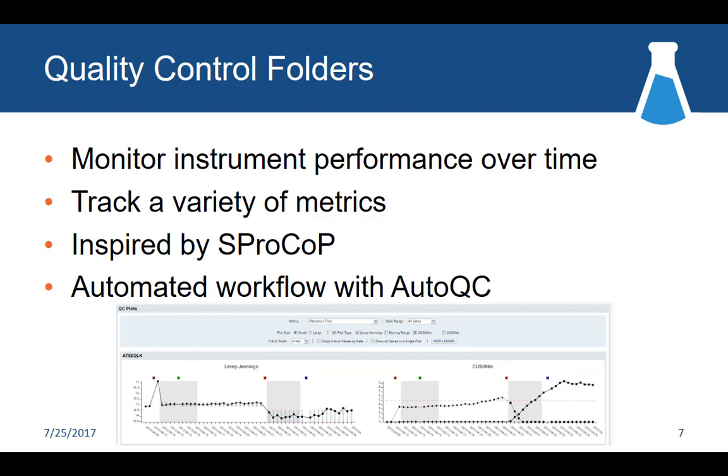So I think this is 50 or so runs of the QC, and you can see very quickly, okay, something went significantly different on that third sample, and then something shifted. We're maybe halfway through our QC samples, and so this gives us a way to dive back and look and figure out, okay, when did things go off the rails? And then also identify, okay, I need to intervene now, because if my QC sample is behaving poorly, odds are my experimental samples are as well.